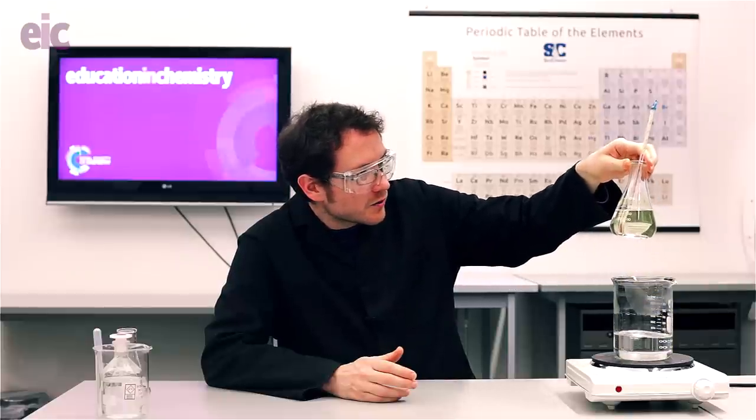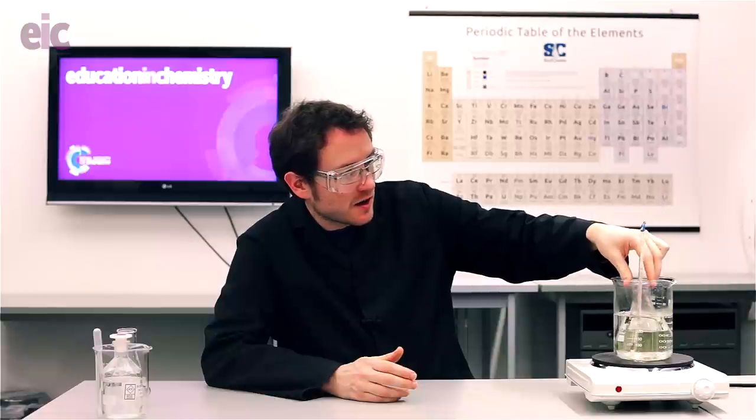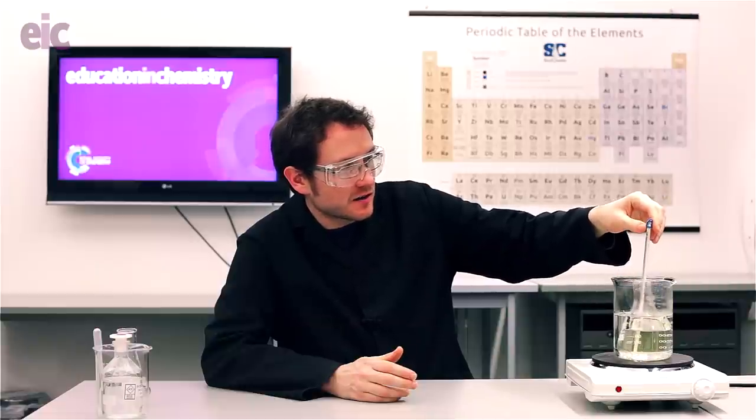My flask has just reached just over 70 degrees and all but a couple of my crystals have completely redissolved. I'm going to let that go for another degree or two until they're completely gone, and then switch my flask over to a better light source to help you enjoy the show. So sit back and enjoy Golden Rain, and have fun sharing it with your students.